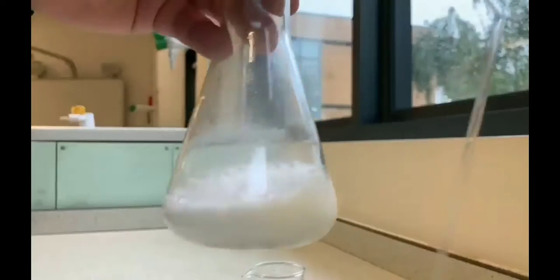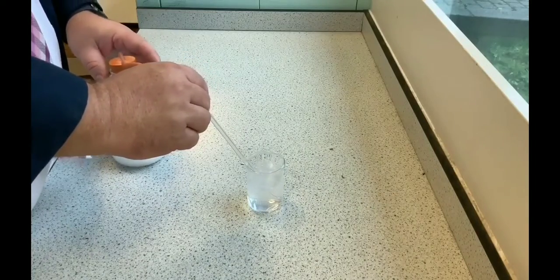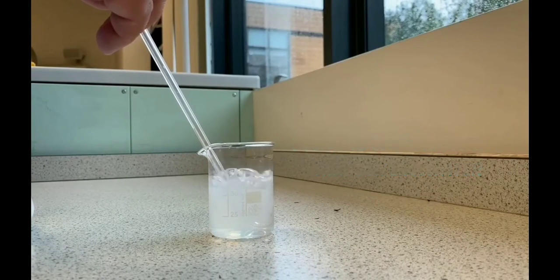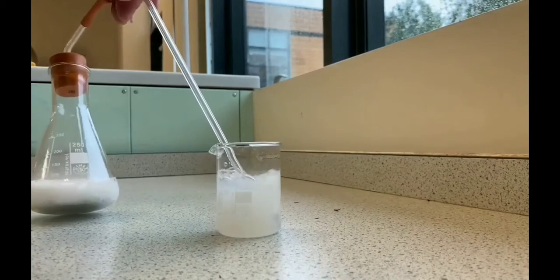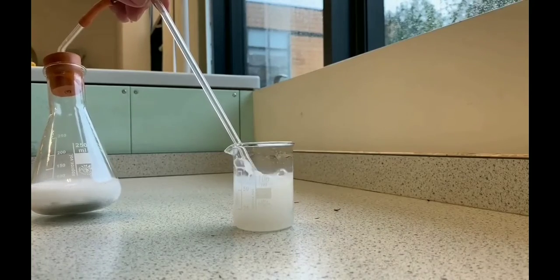So there's my carbon dioxide gas hopefully being produced. I've got my little delivery tube here, and I bubble the carbon dioxide gas through the colourless lime water, and if we look carefully we should see that the lime water goes from being colourless to being milky, or cloudy we could say. It's a precipitate that forms inside which makes it go cloudy or milky.